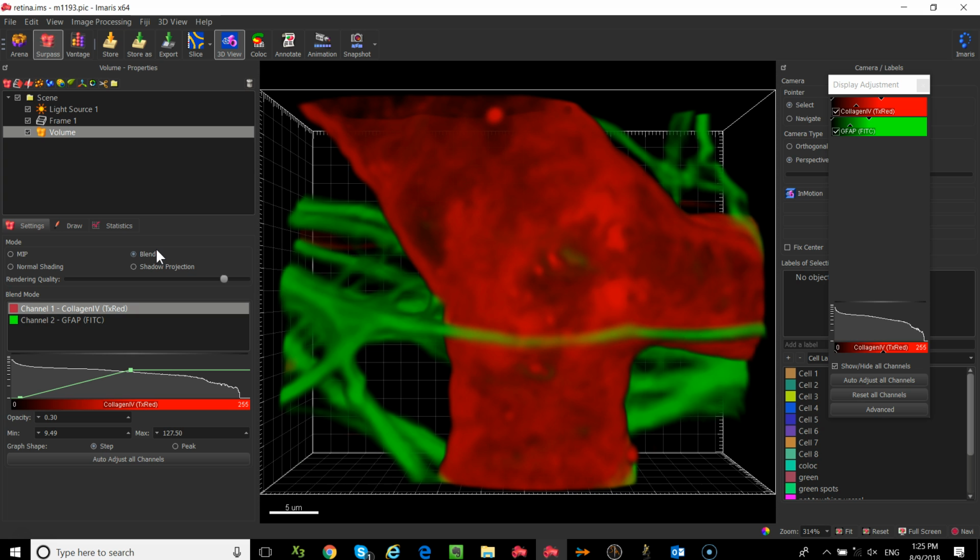And that's going to bring you into this mode where the vessel that we're looking at looks solid. And hopefully your background looks gray, not black like mine. I've set up my preferences a little different. So has everyone got an image that looks kind of like what I see?